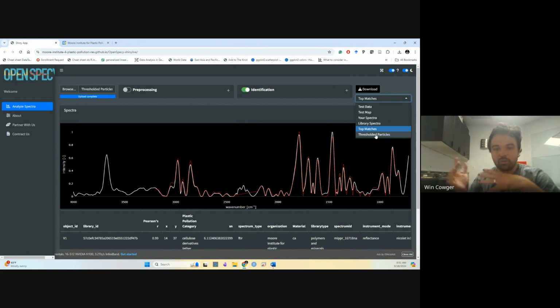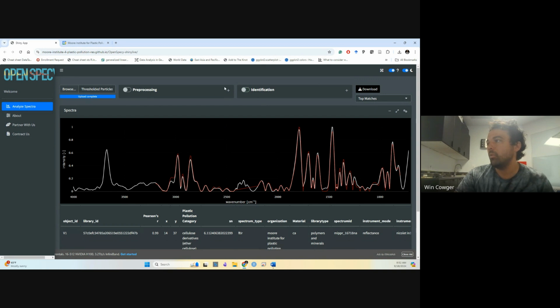There's different ways you can do this kind of analysis though, of course. So hopefully this is general enough. And I'll show you one other way before we jump off of how to do the hyperspectral image analysis. Hopefully when I upload this map, that will work. Let me see here. Yeah, there's definitely some lagging issues going on.